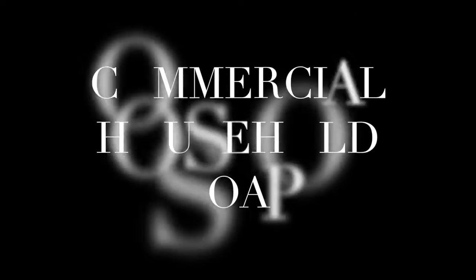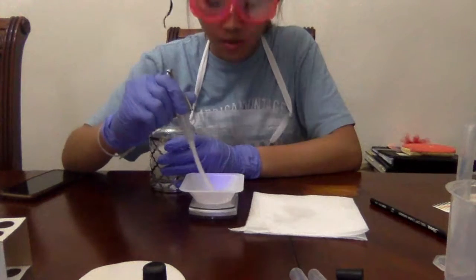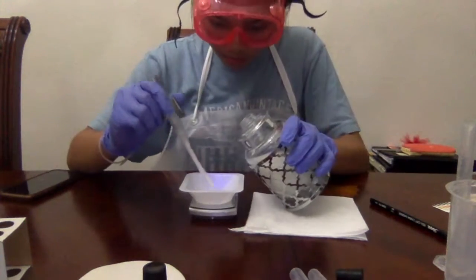Compared to the commercial household soap, a significant difference was observed. In the commercial household soap, it had a pH of around 6. The first test tube here produced a very thick, foamy white layer with a bubbly water solution underneath.